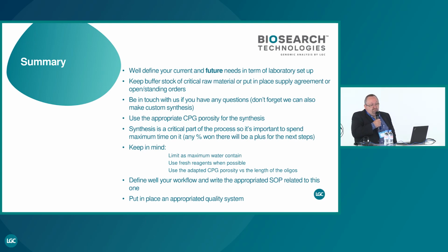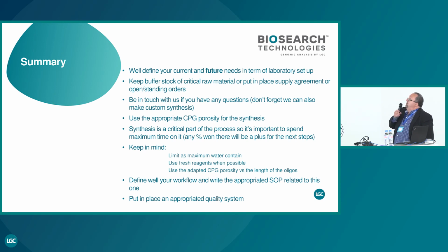Don't forget to use the appropriate support, the CPG, porosity. I think it's something sometimes people forget, but this is a very important step. And don't forget that synthesis, for me, is really the critical part of the process. Any impurity you have will be a problem for the next step. Keep in mind to limit the water content. Use fresh reagent when possible.